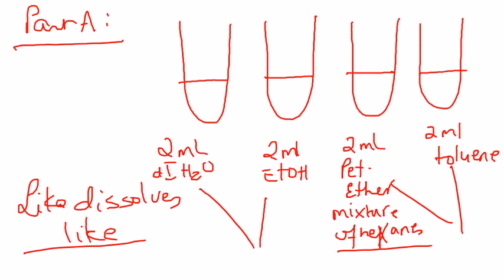Now, it's a possibility if you are not able to figure out your solubility in clearly one pure solvent, you might have to use a mixed solvent. But for the purpose of time and for the purpose of the amount of effort each group should put in, I will assign you compounds which do not require mixtures, but rather just one of these. Okay, so you don't have to worry about it. Just know that that's a possibility also.